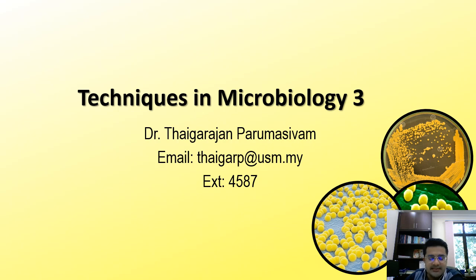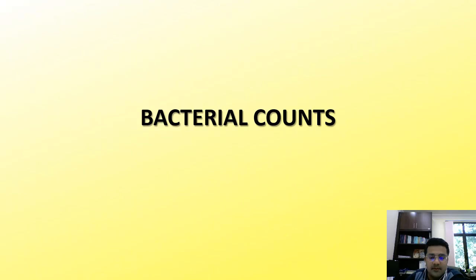Oh, hi everyone. So this is the last lecture in techniques in microbiology. This lecture will cover bacterial count, which means we will learn the techniques on how to count the number of bacteria in a sample. And this lecture is quite relevant to practical too.